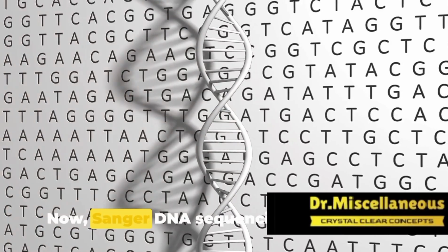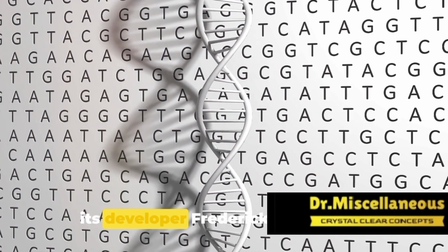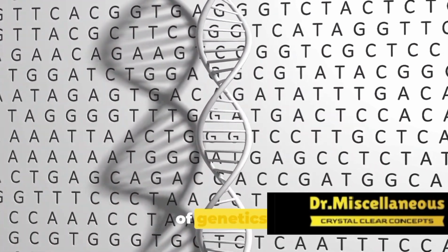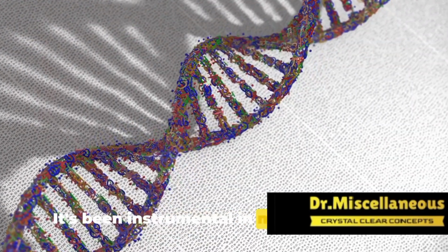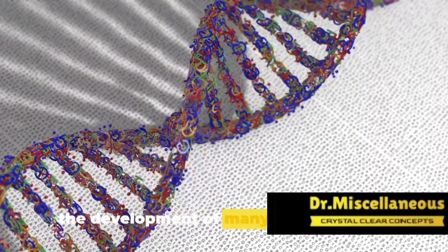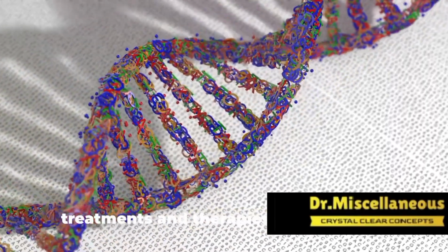molecule. Now, Sanger DNA sequencing, named after its developer Frederick Sanger, is a method that has revolutionized the world of genetics. It's been instrumental in mapping out the human genome, and has played a key role in the development of many of the genetic treatments and therapies we see today.